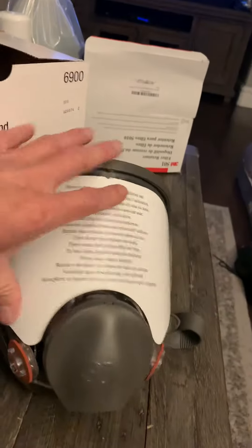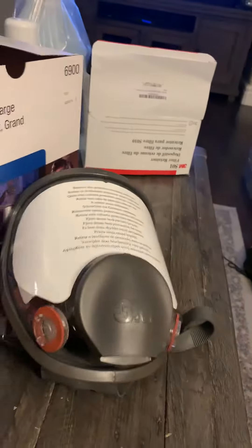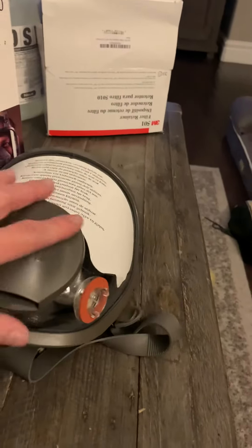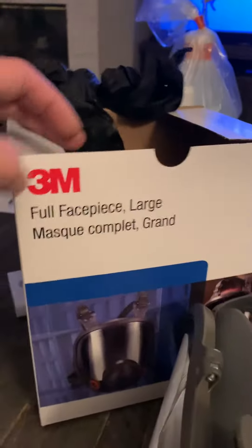Got a protective shield for the front here. It's got where you hook up the cartridges. You do need to get the right size — this one's large.